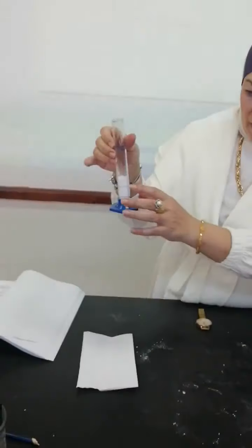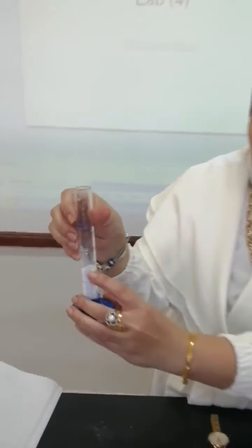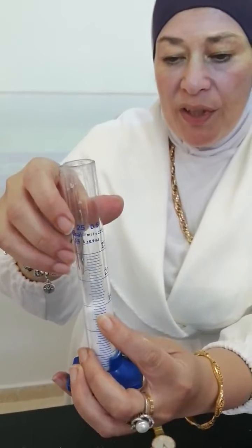After 2 minutes, we get the volume, which will be around 14 ml.